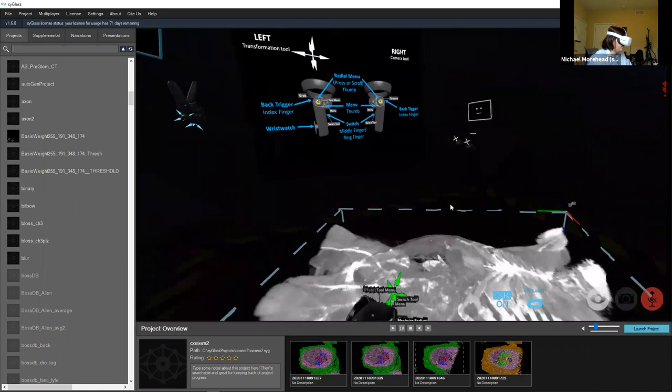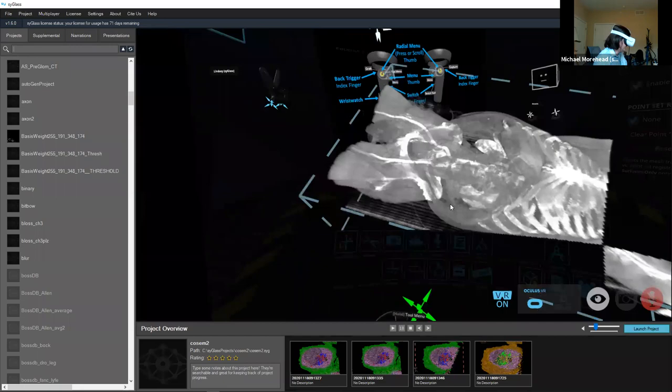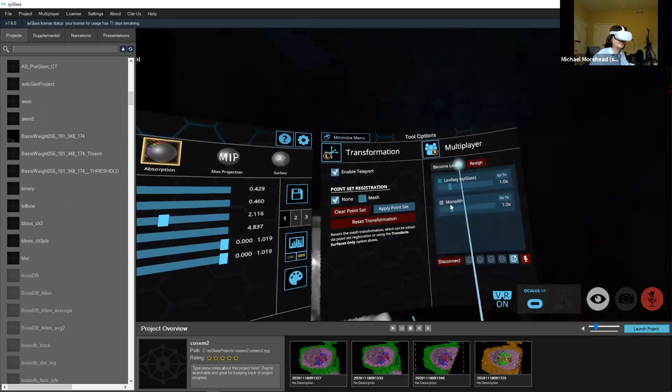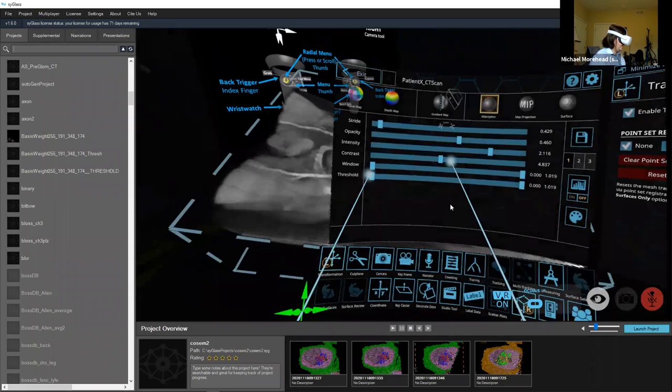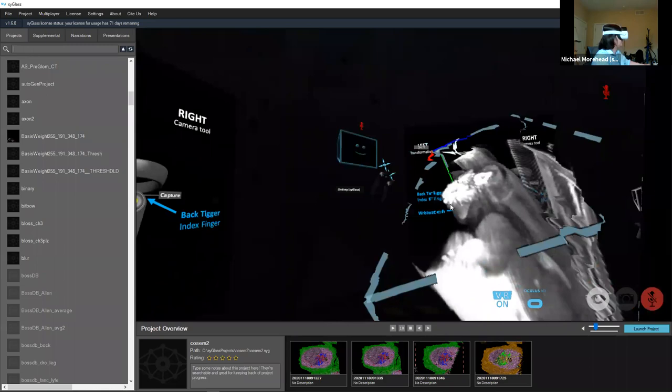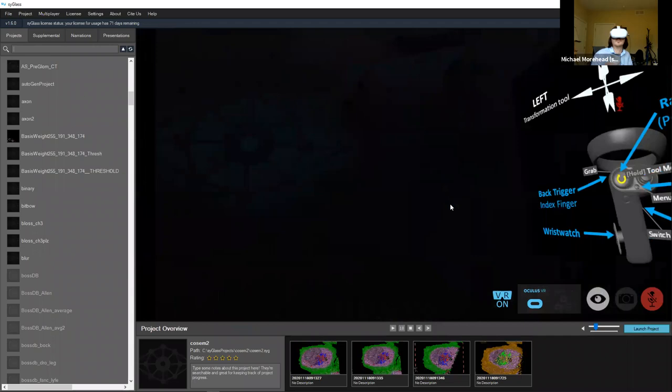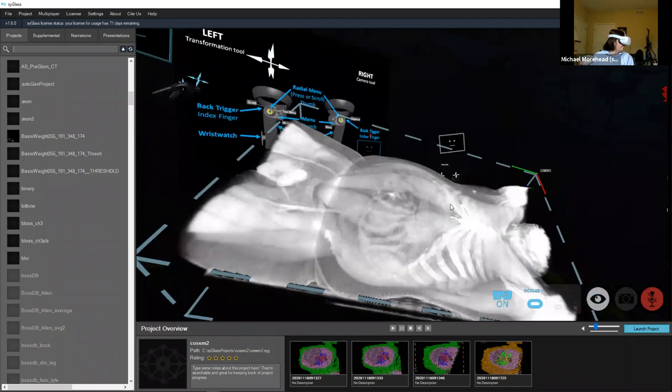There is a leader capability: someone gets a star on their head and only they can move the data or control the settings — like a teacher mode. When you're the leader, others can see your menu. I can adjust the contrast slider to make whites wider or everything more gray, change intensity, switch to maximum intensity projection where the bone — the densest thing — comes through the most.